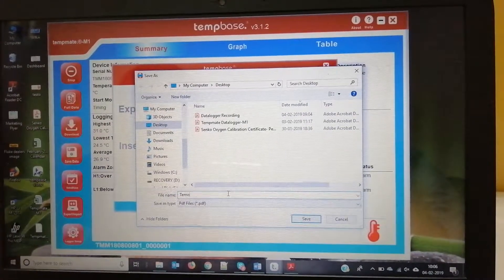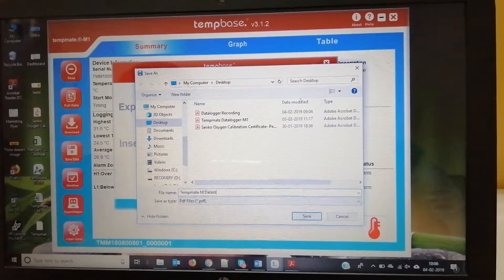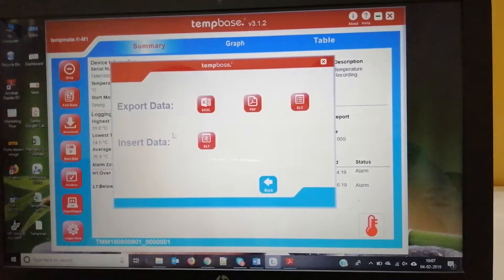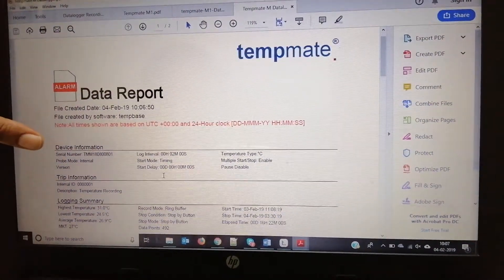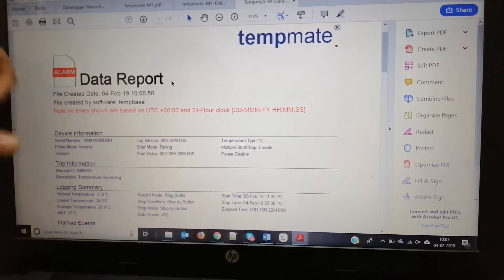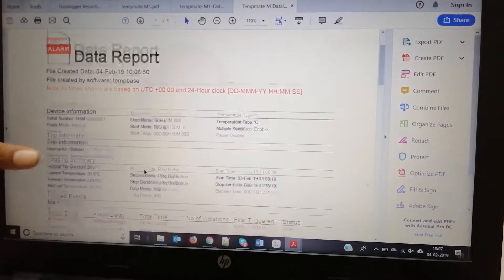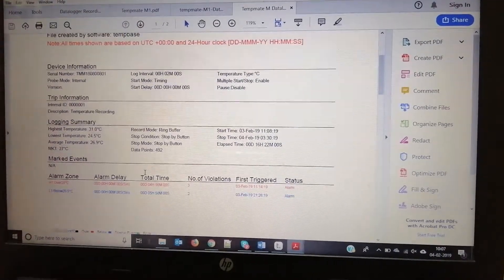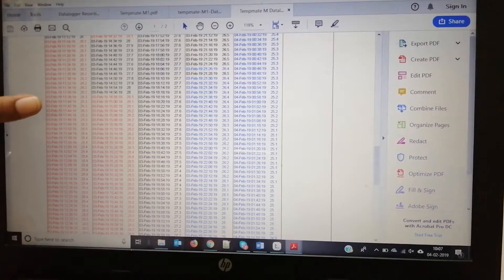Now I'm exporting the data to PDF format. It will now open the dialog box. Here you can see the report in PDF with all the details of the device — the serial number, temperature type — everything which we have seen in the software.